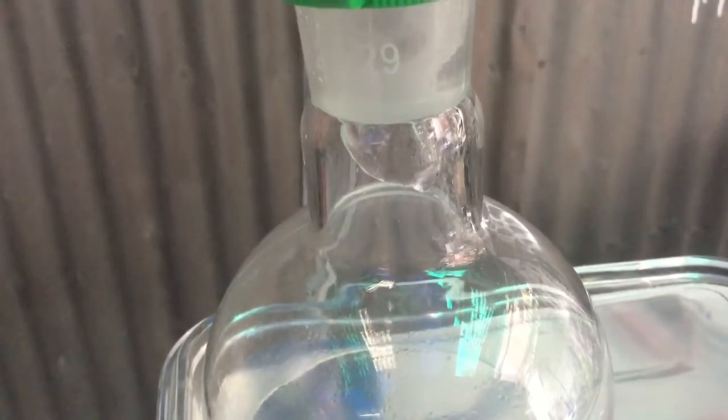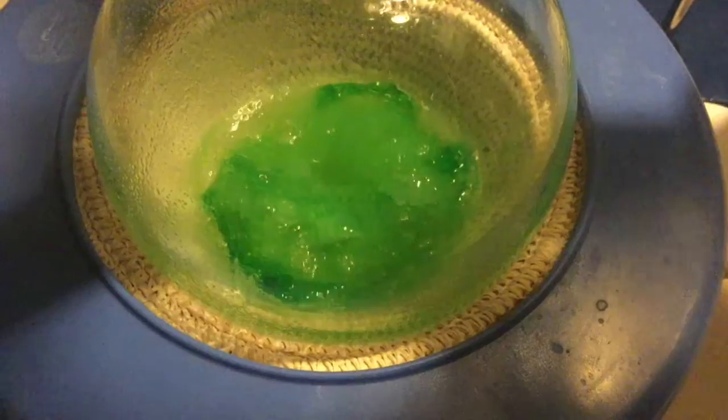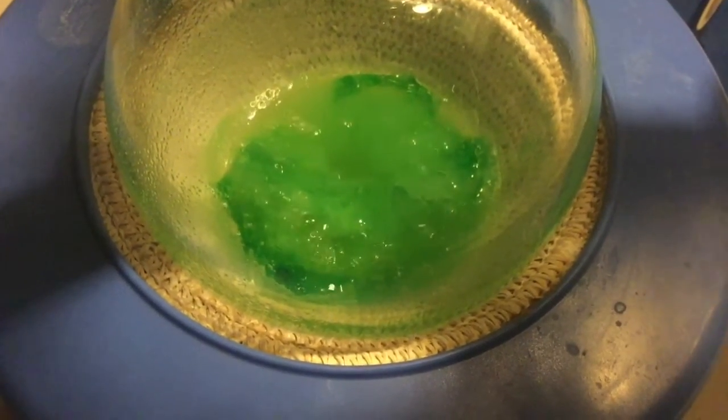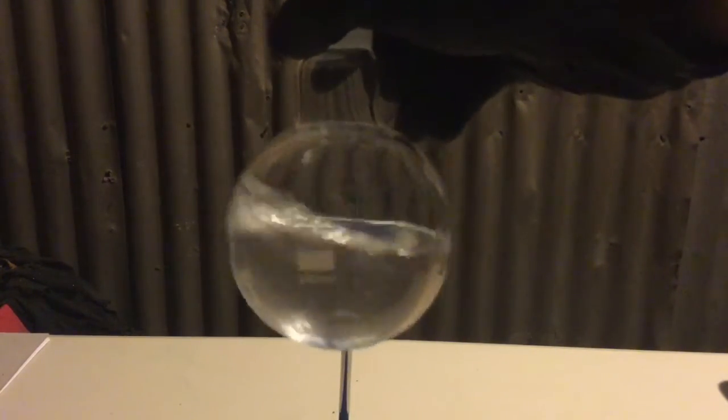The distillation was considered finished and stopped when no more distillate came over and it appeared the mixture in the boiling flask as you can see here was simply refluxing. This is the amount of DCM I got from the distillation and it's not completely clear. This is probably because when I first started the distillation I turned the temperature too high and about 30ml of cloudy distillate came over.